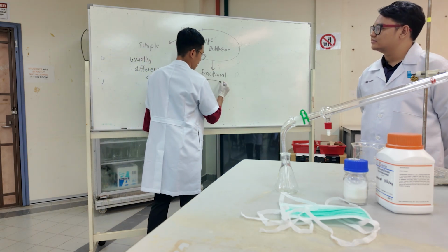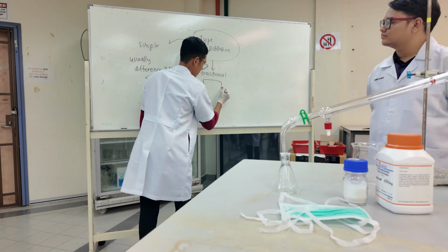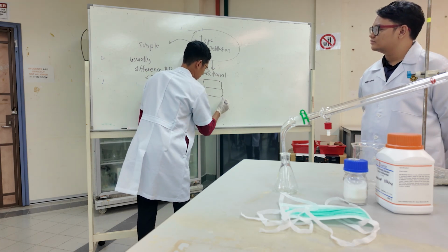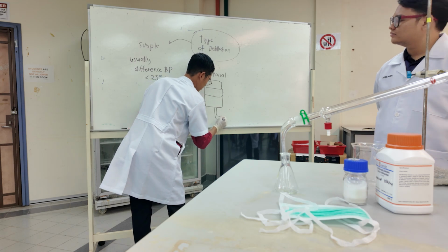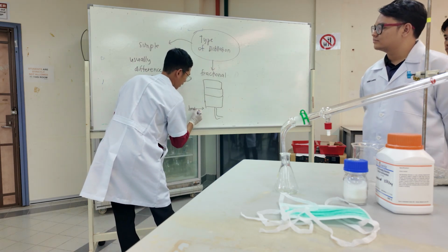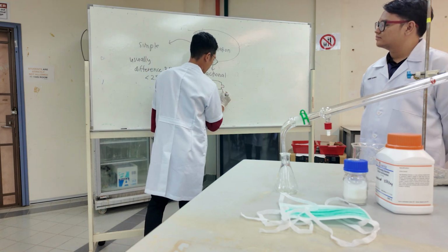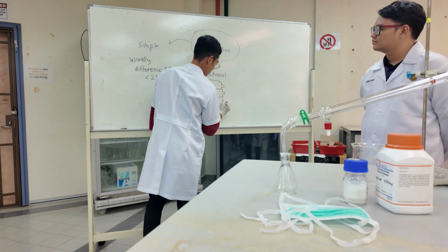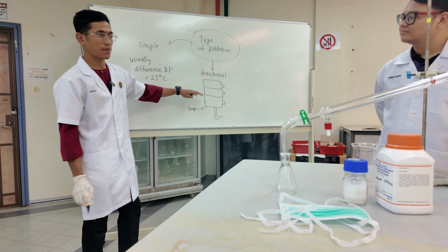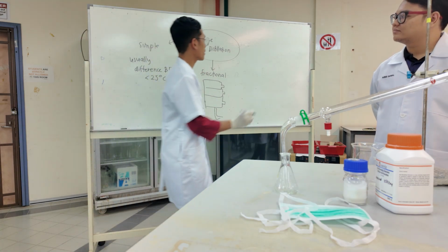The figure for fractional distillation is like this, where this has a heat source and has a fractional part to distill.